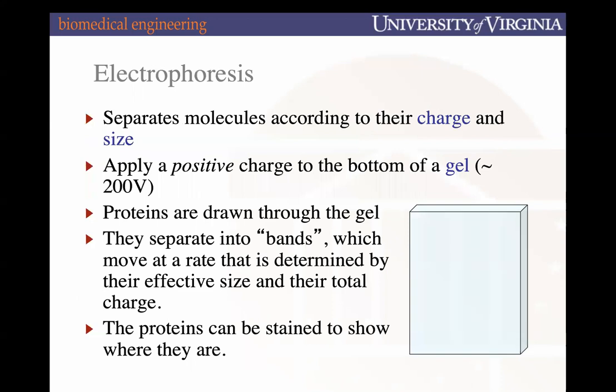So one of the key methods that we use to detect and analyze proteins is called electrophoresis. Does anyone, whether you have a background in Latin or not, want to define for us what electrophoresis is? Why don't you take a stab at it? Yeah, that's pretty much right on.